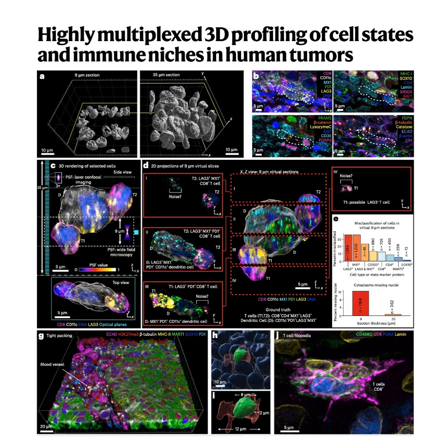It does. And what really struck me, the thing that 2D was utterly missing, was the visualization of these incredibly fine, extended structures that cells use to communicate and explore. It's like seeing the hidden communications network, the cellular equivalent of maybe telephone wires or probing antennas. You mean things like filopodia, those thin extensions? Exactly. Filopodia, dendrites, membrane ruffles.